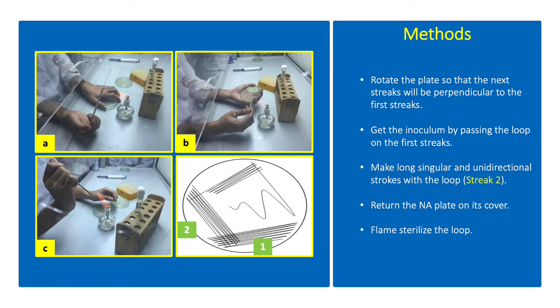Rotate the plate so that the next streaks will be perpendicular to the first streaks. Get the inoculum by passing the loop on the first streaks. Make long, singular, and unidirectional strokes with the loop. Return the NA plate on its cover, then flame sterilize the loop.